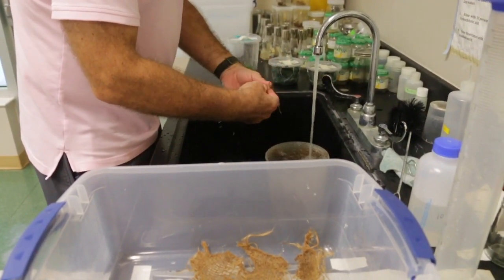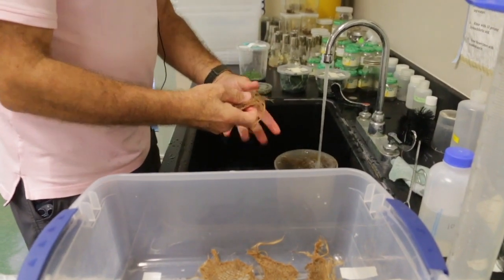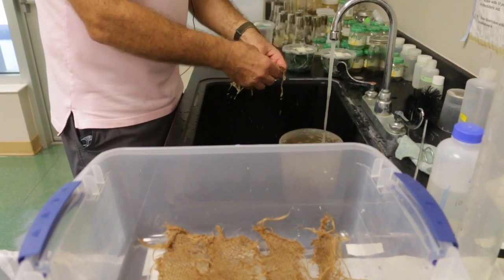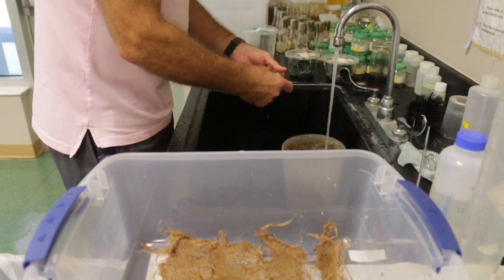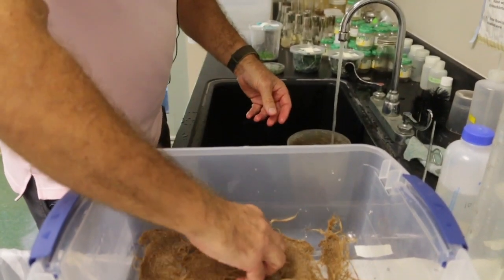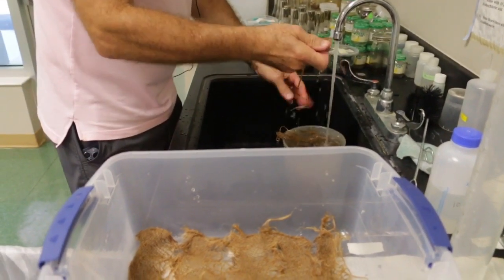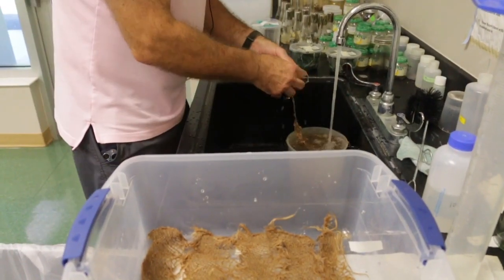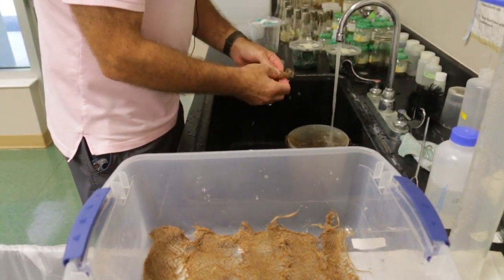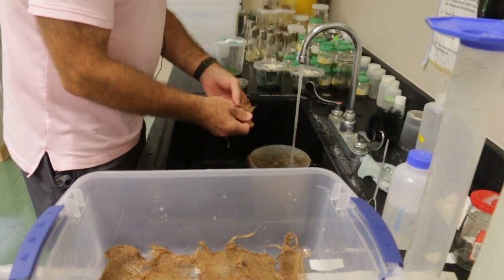Some of the burlap orchids that I have, Burlap Phals, which is my favorite, work out really well, and I have some Burlap Phals that we're going to be doing. I also have some that I'm going to call burlap Guars, Guarianthe aurantiaca is what we have. The reason I'm doing the Guarianthe aurantiaca is because I've got a couple of flasks that are contaminated. So rather than just toss the flasks, which is what I normally do, I am going to deflask these orchids onto burlap.